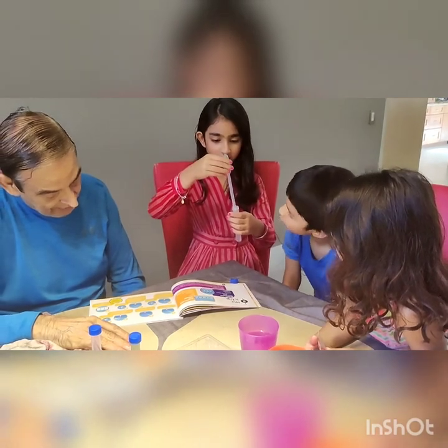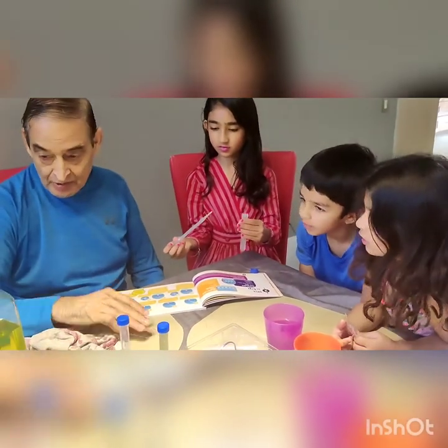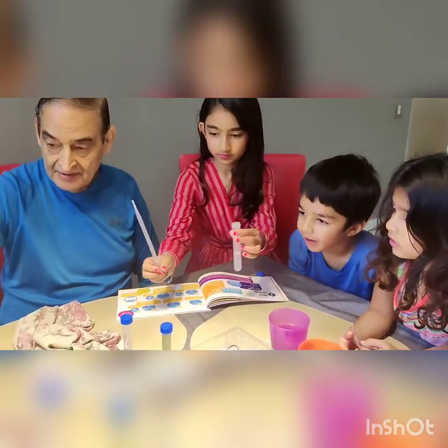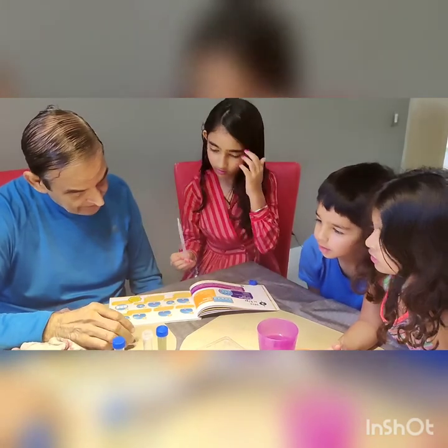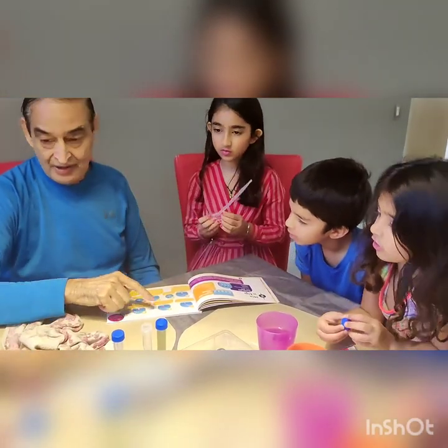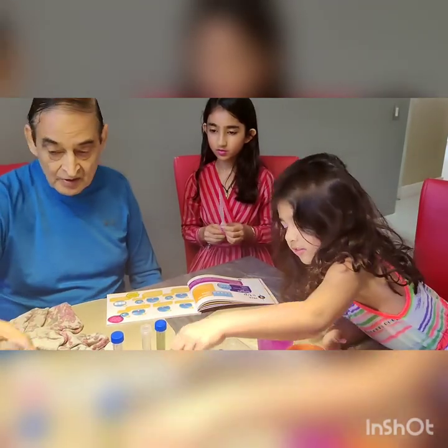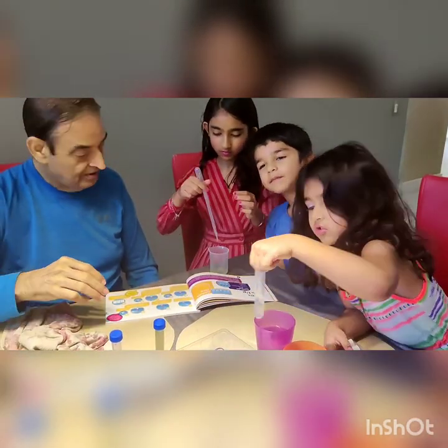Add 5 ml of oil into the same test tube. Now, this time, you have to put 5 ml of oil. 5 ml? Now, how will you put 5 ml of oil? Same way? Oh, the pipette. Okay. Where's the pipette?